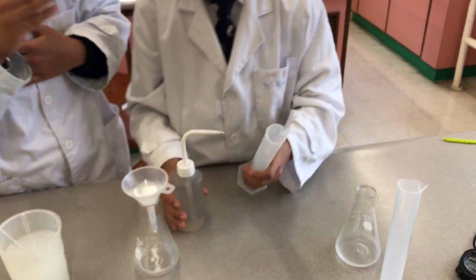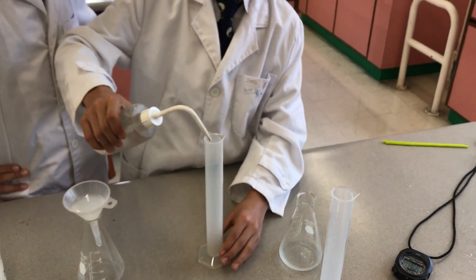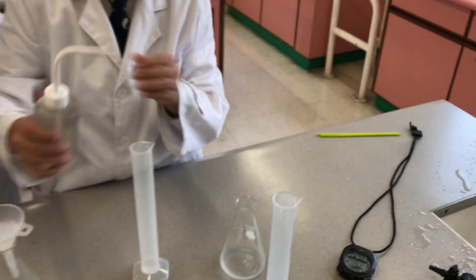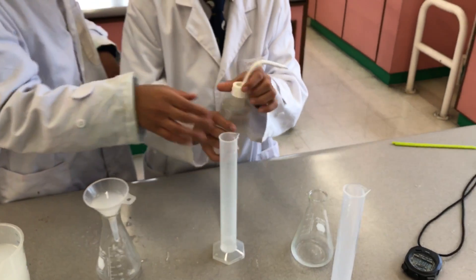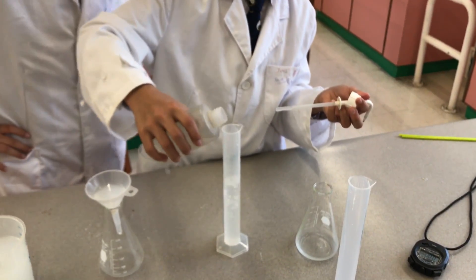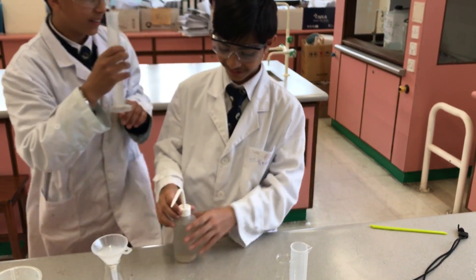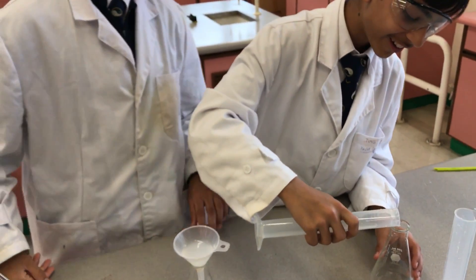We will take another measuring cylinder and put 70 ml of water in here. When you measure, put it here, and then add the water. Take it out. 70 ml — remember 70. It is 70. Pour a little bit. Now we are going to put it in the conical flask.